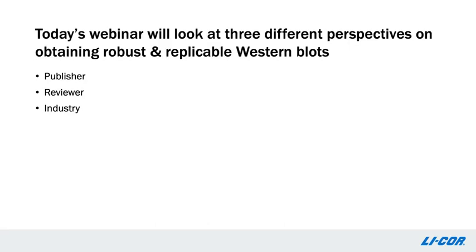Today we're going to be looking at 3 different perspectives on obtaining robust and replicable Western blots. And we're going to be looking at the perspectives from publishers, reviewers, as well as industry.